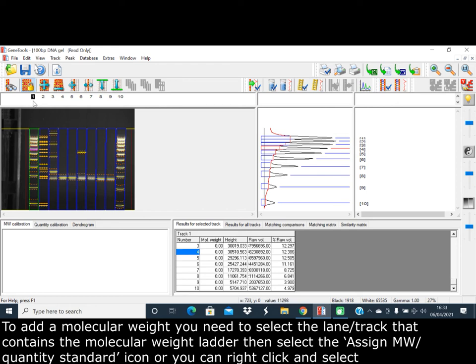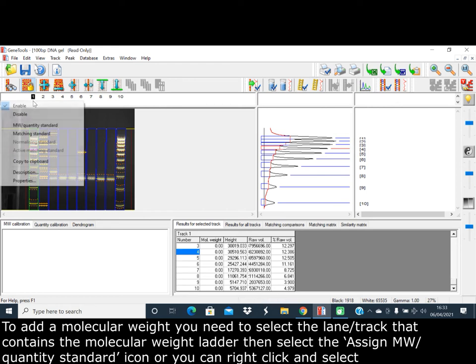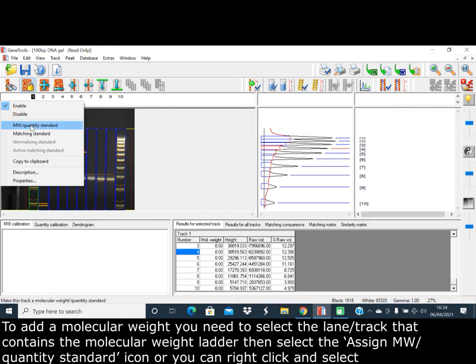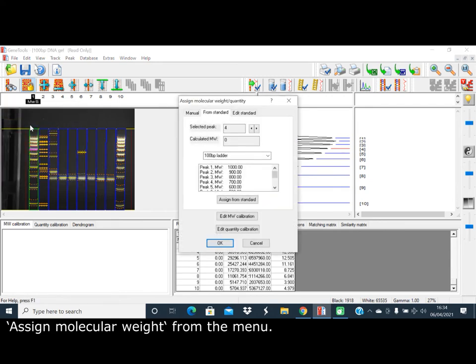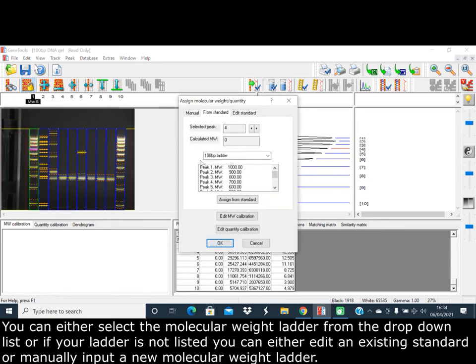Or you can right-click and assign a molecular weight/quantity standard from the menu. You can either set a molecular weight ladder from the drop-down list.